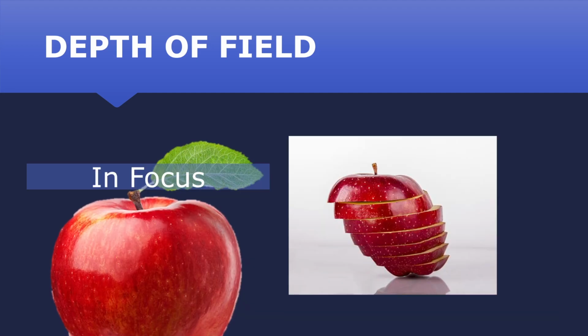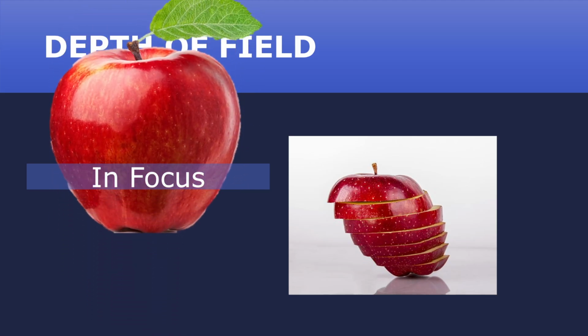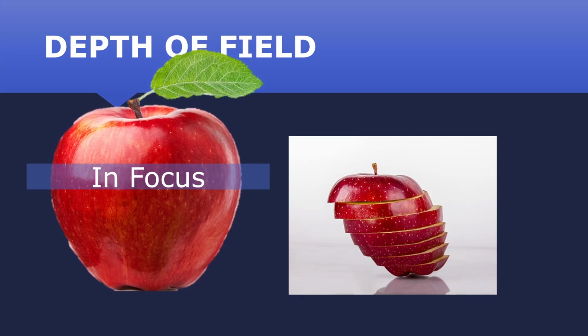On a microscope, turning the coarse or fine focus knobs raises or lowers the stage, moving the specimen through that focal plane. Since most samples are transparent, you're effectively slicing through the sample in the third dimension.